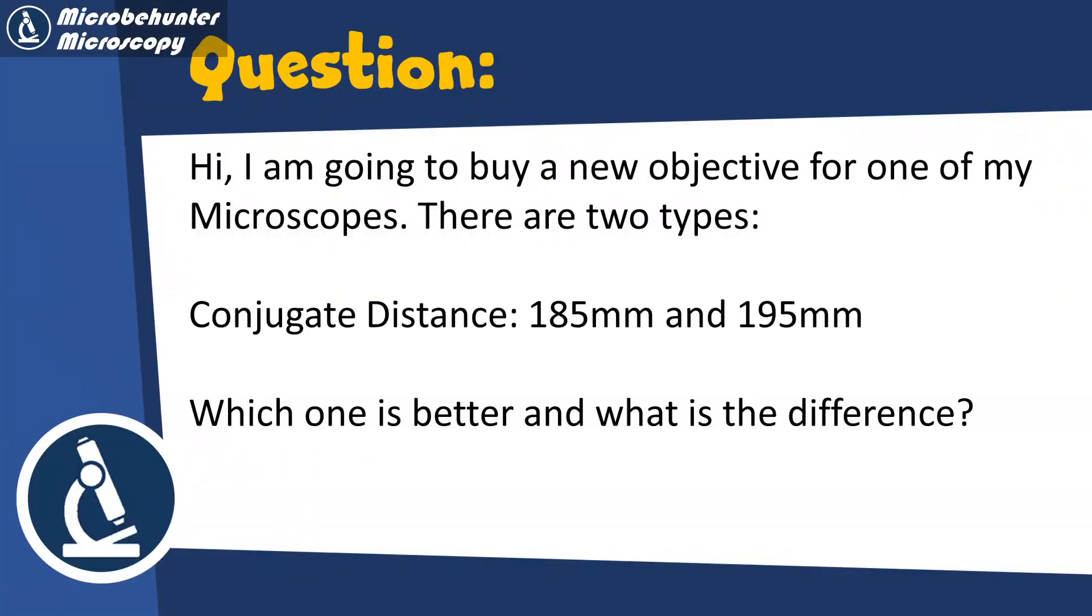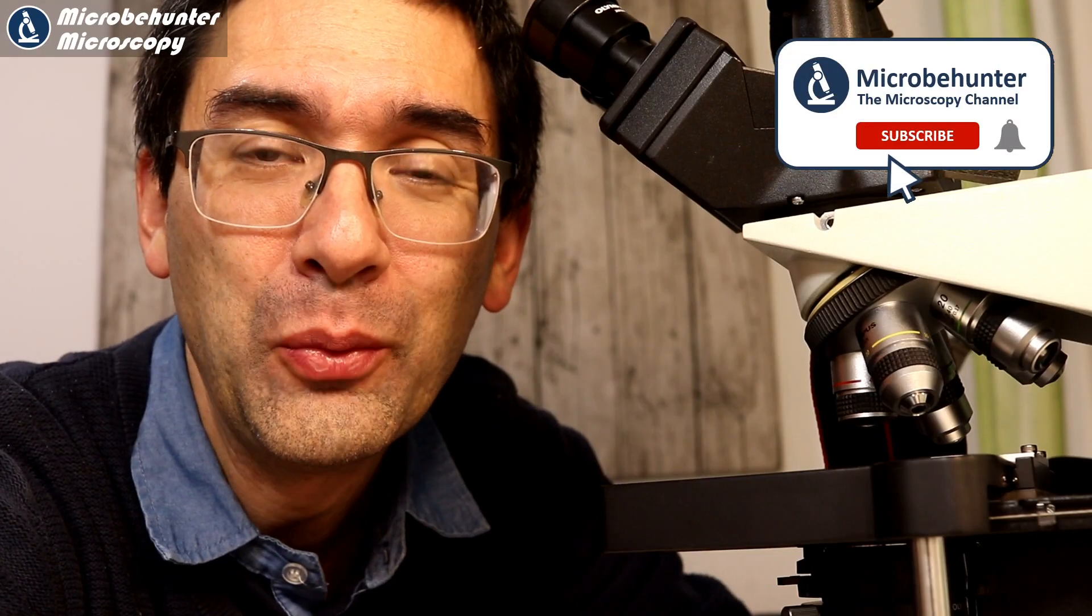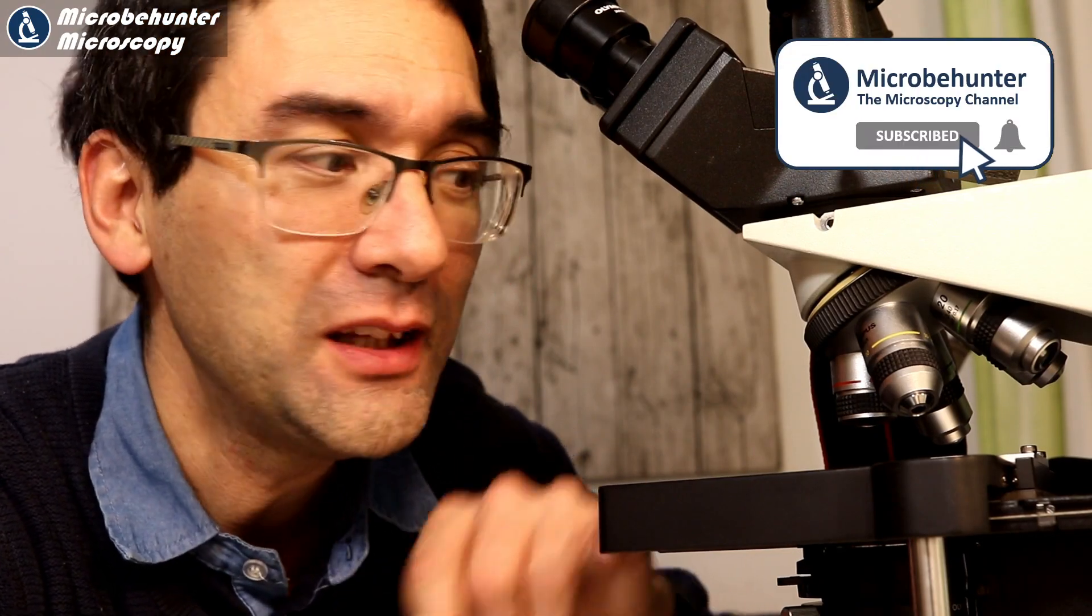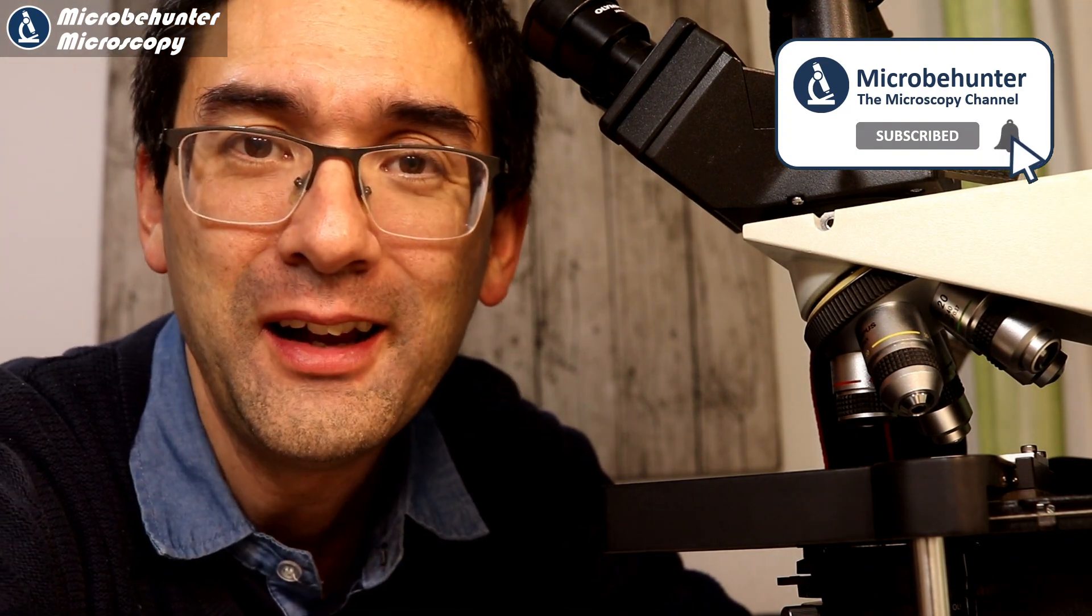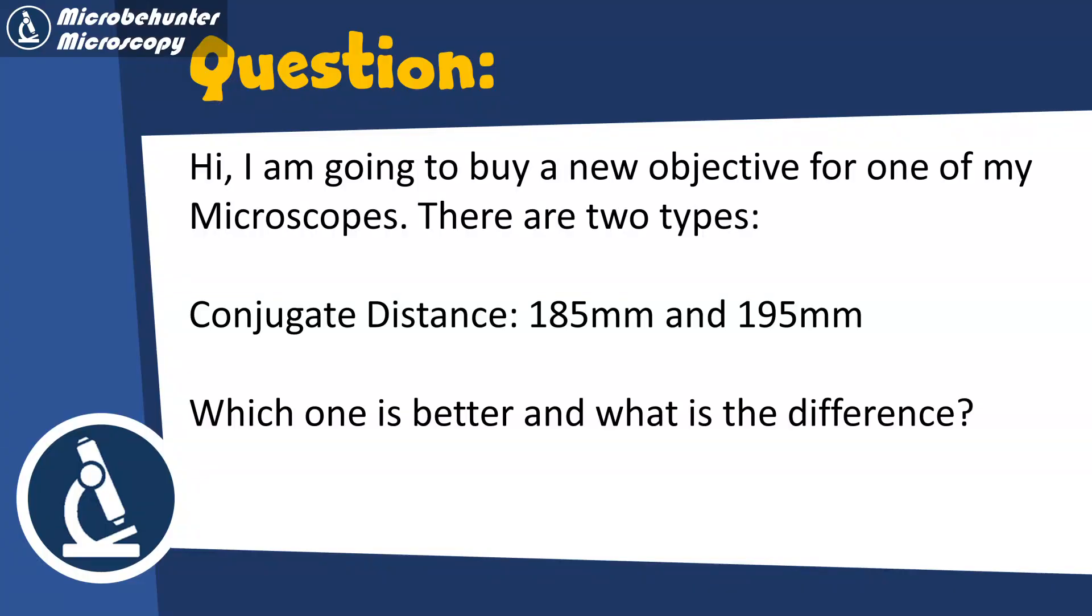Some of my YouTube viewers wanted to know which type of microscope objective to buy, and they found two different versions: those with a conjugate distance of 195 millimeters and those with a conjugate distance of 185 millimeters. I would like to explain what this actually means in this video.